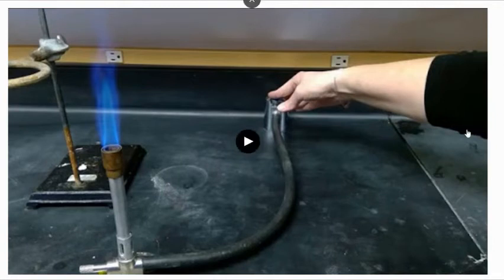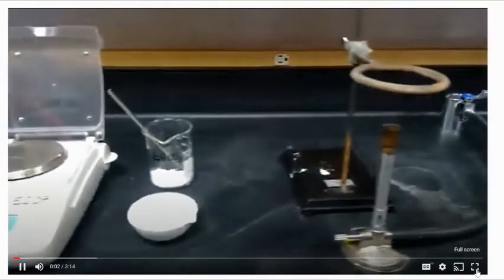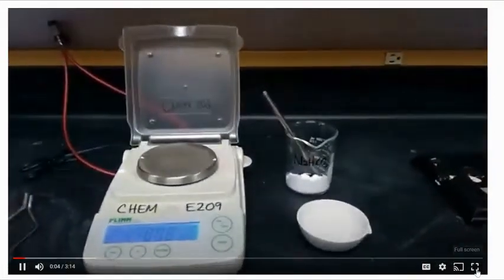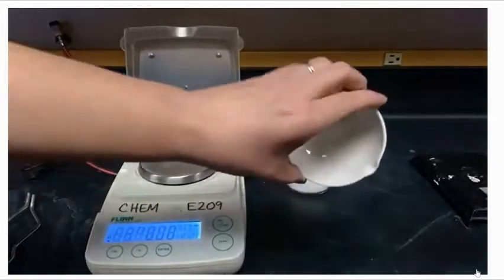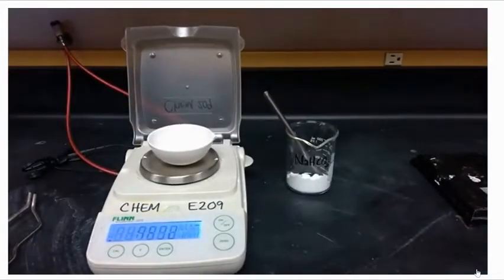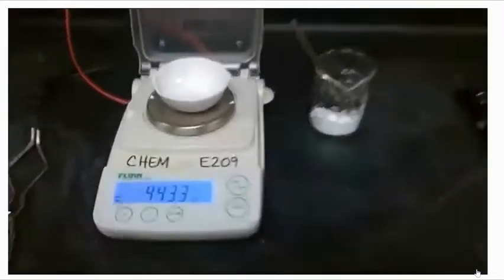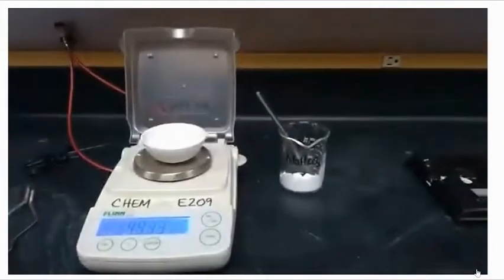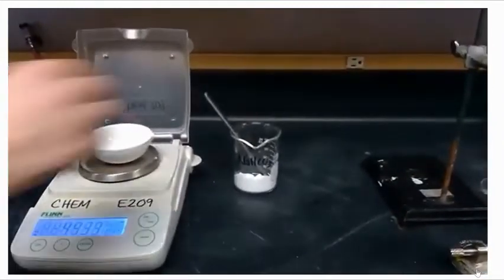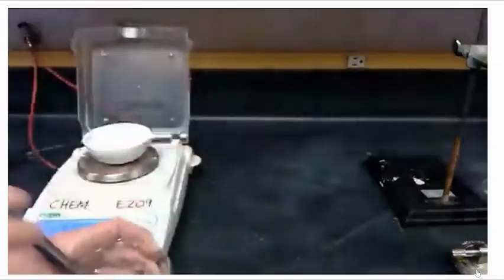So if you were absent on the day of the lab, you can gather a virtual data set using the video below. So we can see the evaporating dish. You can get the mass of the empty evaporating dish, 44.33 grams. Now we're going to add baking soda, sodium hydrogen carbonate.